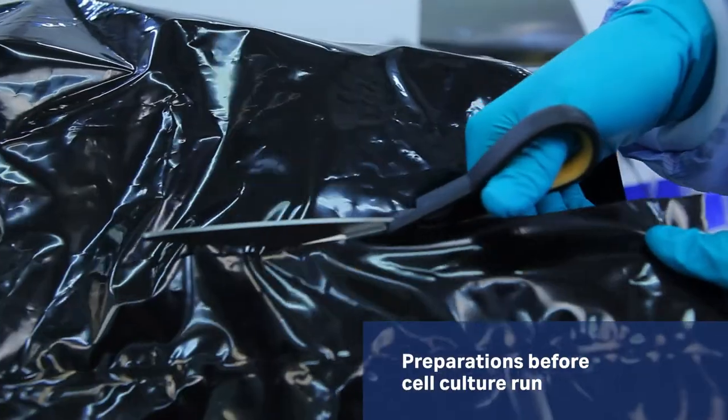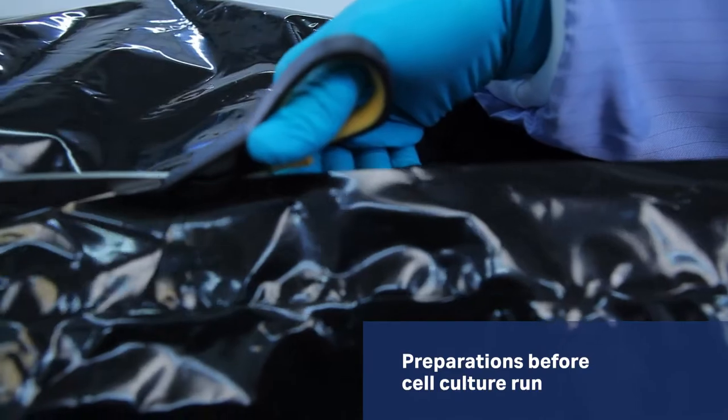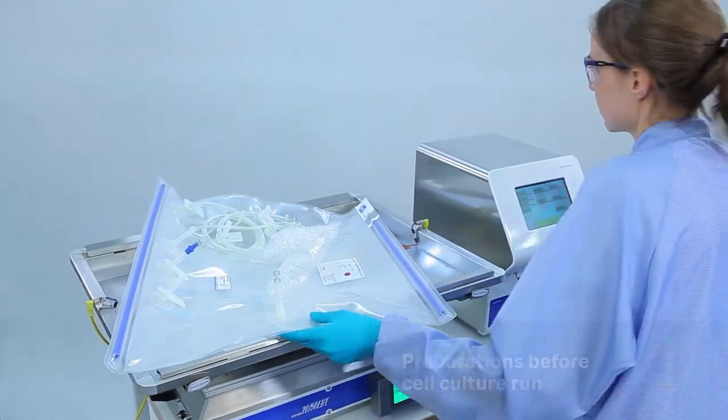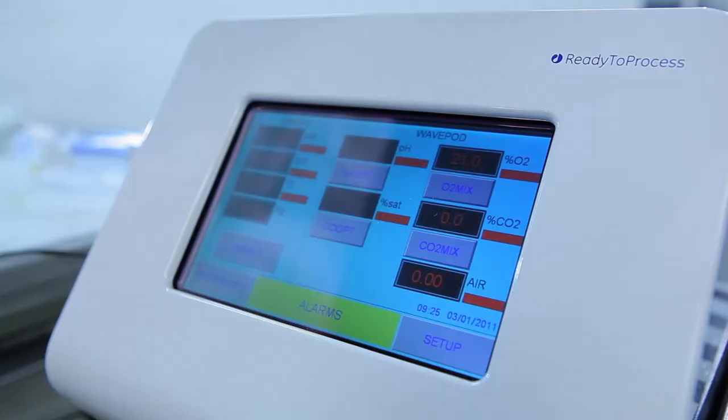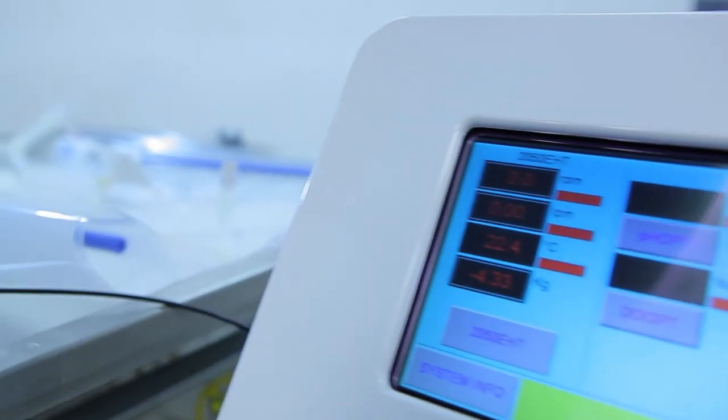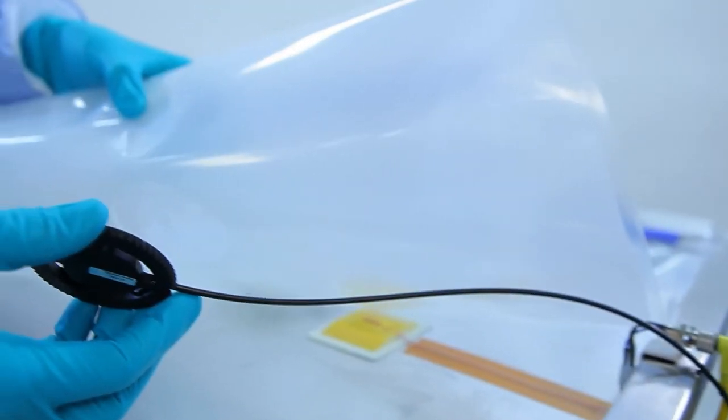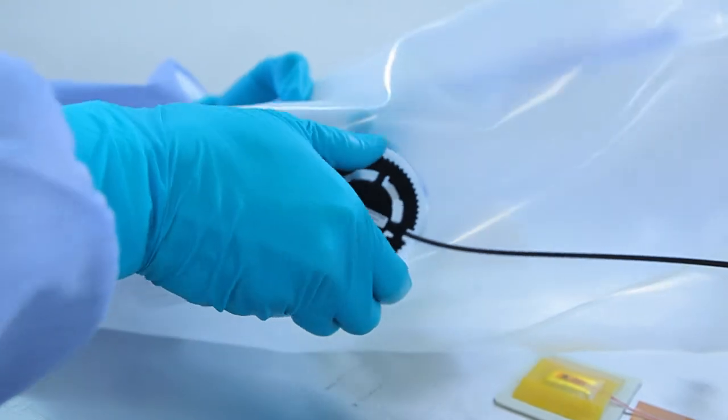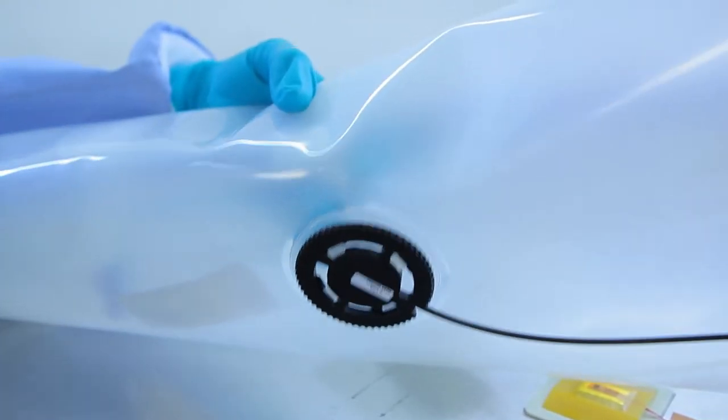When starting up your run, begin by removing the cover bag of the cell bag bioreactor. The WavePod 2 measures and controls pH and dissolved oxygen during the run. Place the pH bag adapter with the sensor facing the pH bag port. Rotate the bag adapter clockwise to fix the parts to each other.